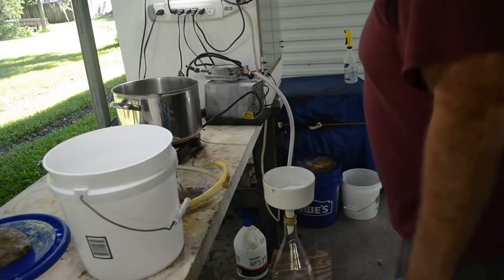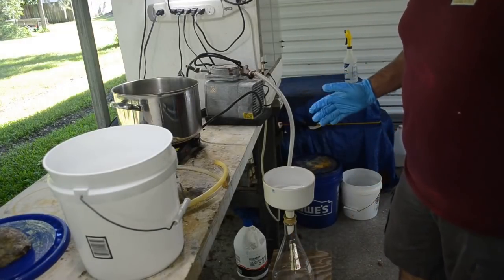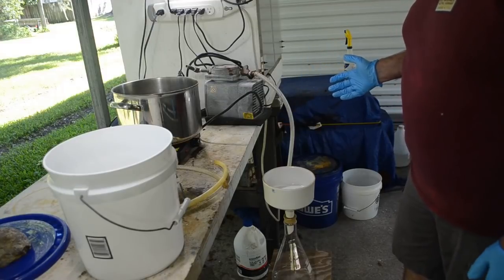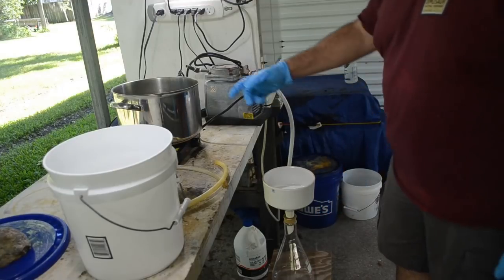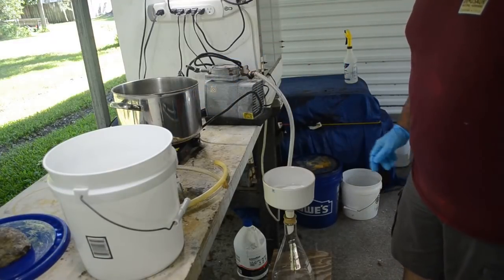Okay, we're ready for filtration. Now the way I'm going to do this is I'm going to vacuum filter it just because it's quicker. And I've got a lot to do today, so I've got to get this done. I'm probably going to have to do it in three batches because my filter flask only holds about 2 liters. And there used to be 6 liters in here, although I can tell the level's down some.